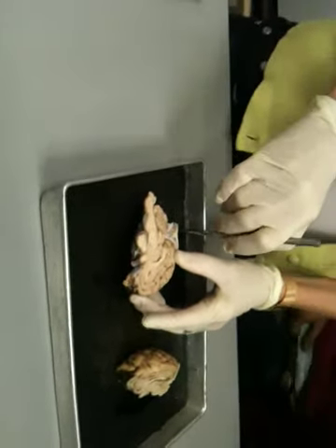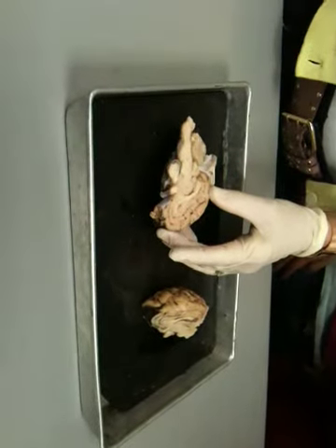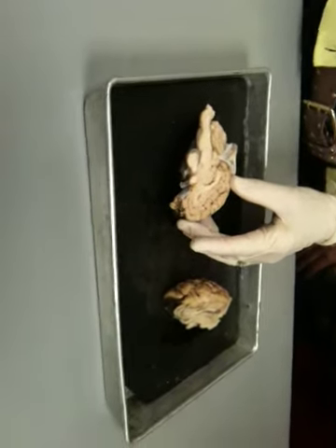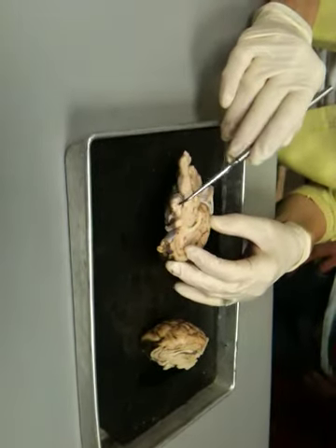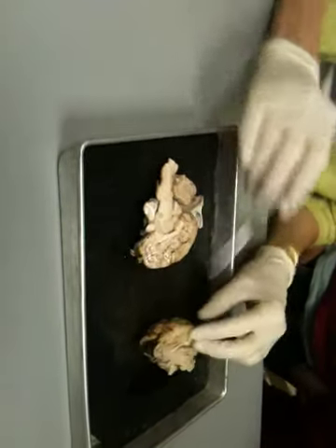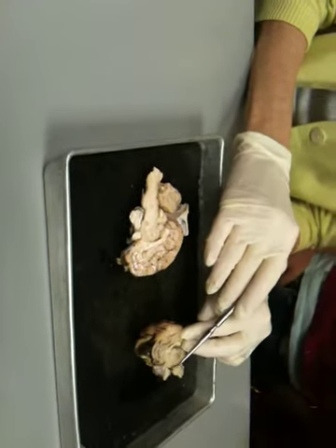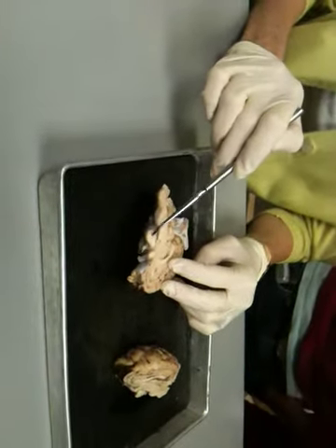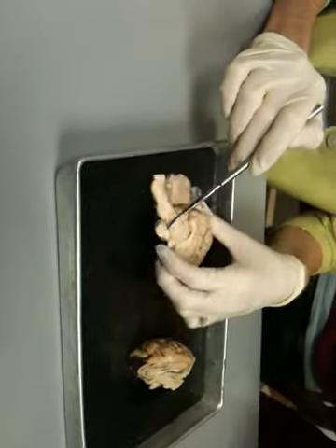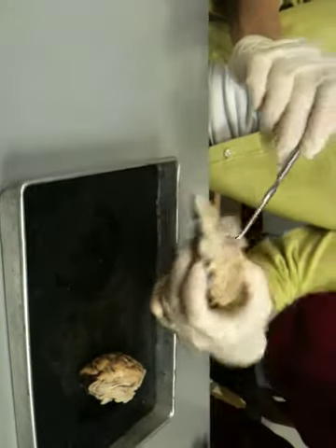Everybody, we're doing the sheep brain. You guys, I don't know if you can all see. So if you're on the periphery here and you can't see, then I'll go over this again. Okay. So this thing here is the pituitary gland. On some of these brains, you may not see this because sometimes when the dura mater is removed, it will pull the pituitary off. So you may not see it, but I think you guys have probably all had a brain that has had the pituitary attached. Okay, so that's it.